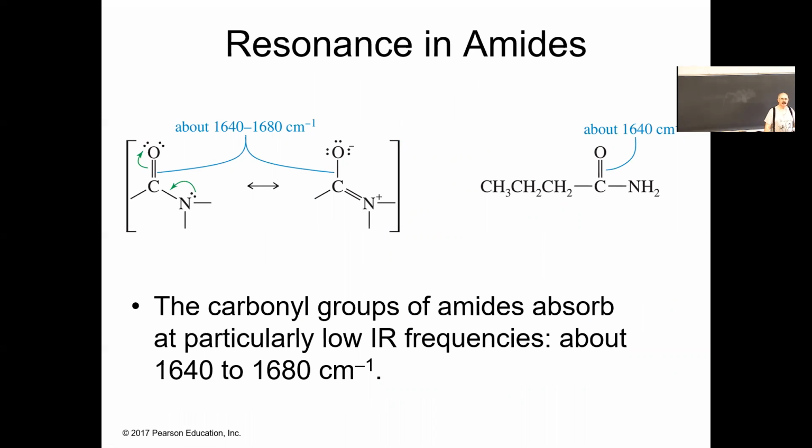Okay, resonance is a very significant factor in amides. Amides will have a considerably lower frequency for the carbonyl, 1640 to 1680. The CO bond has considerable single bond character.